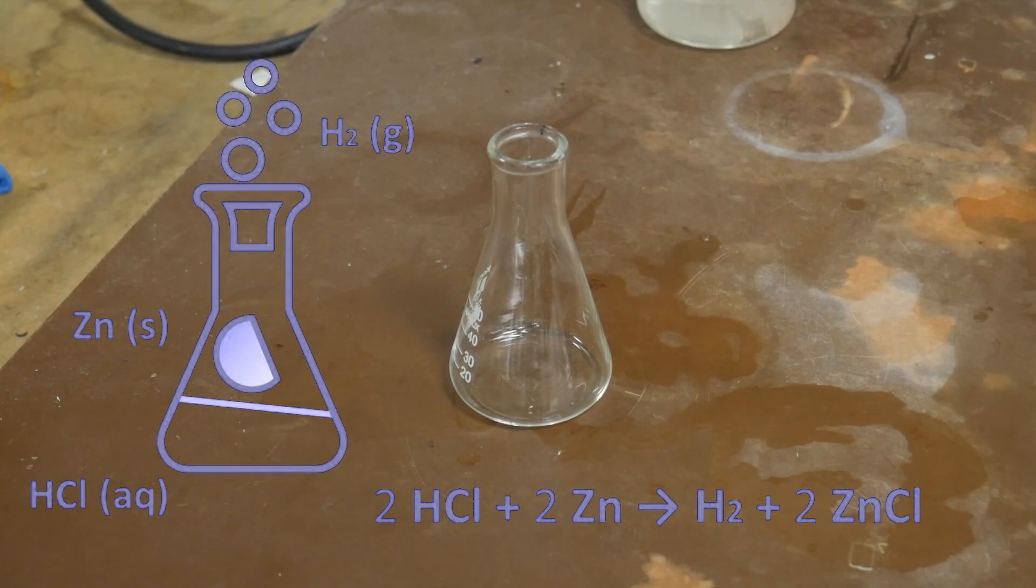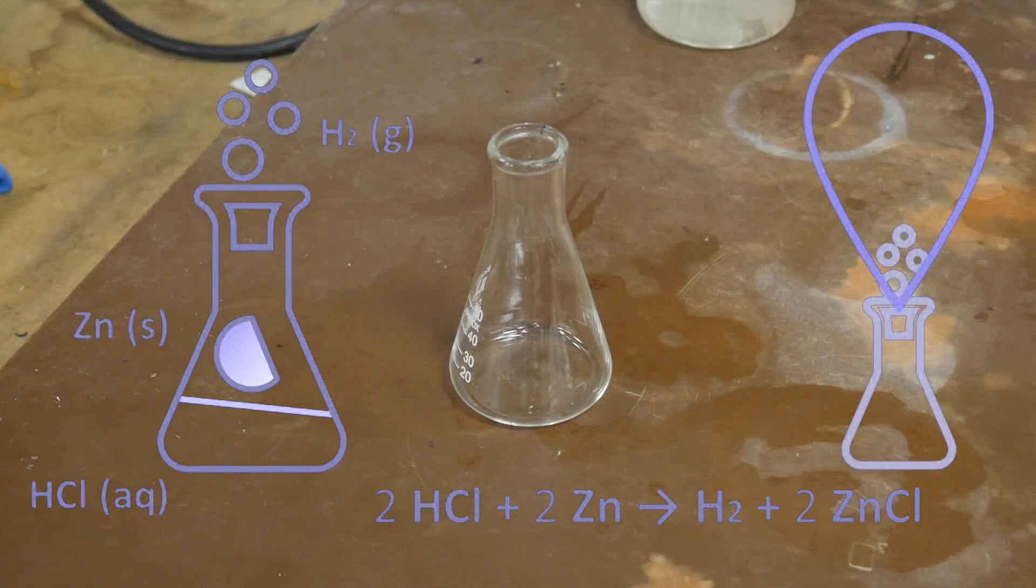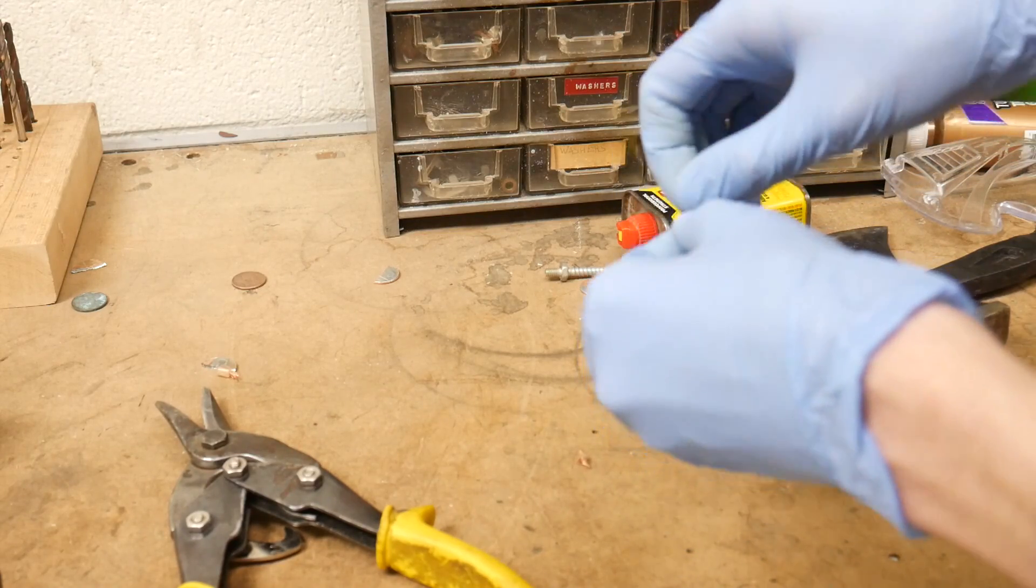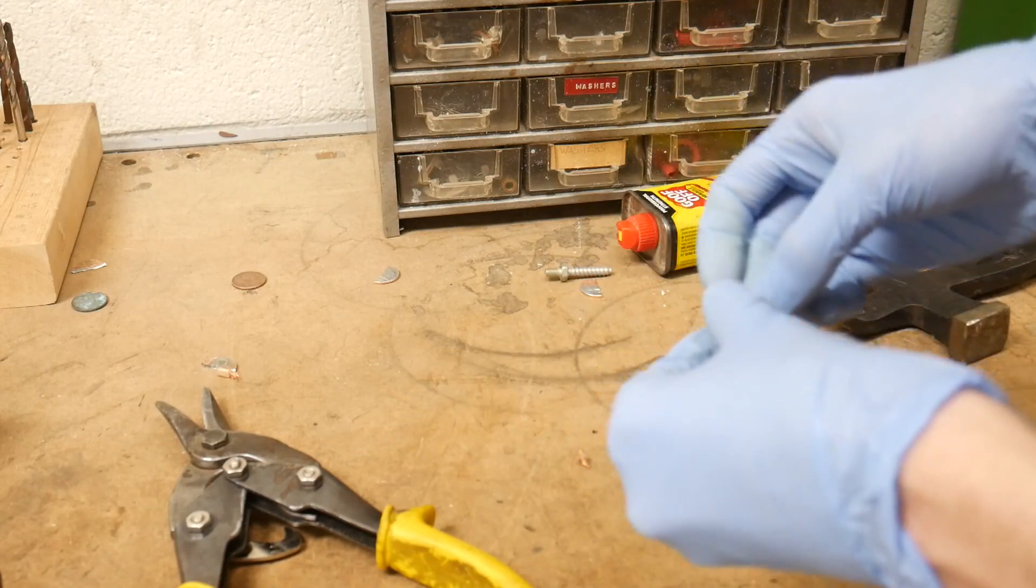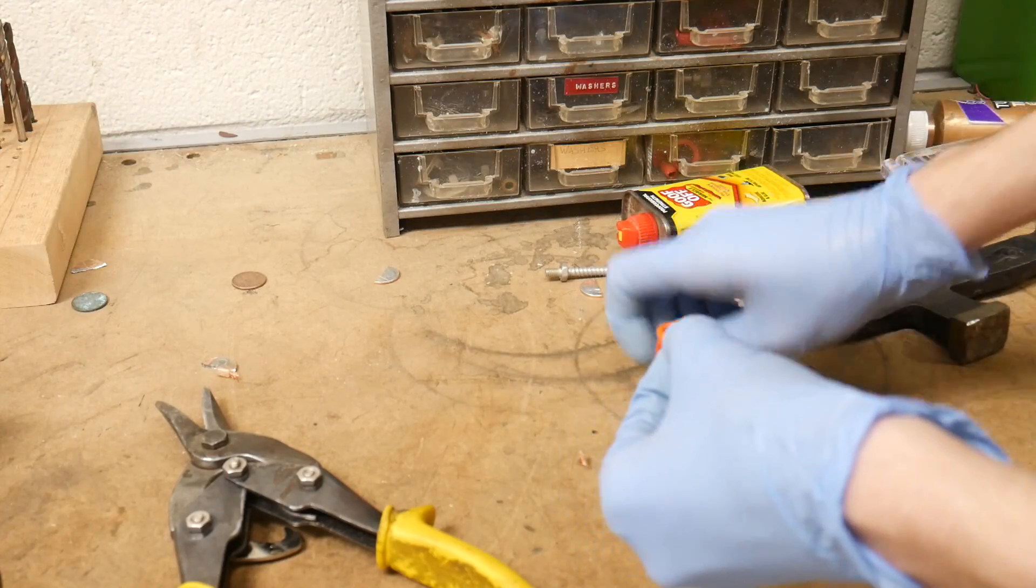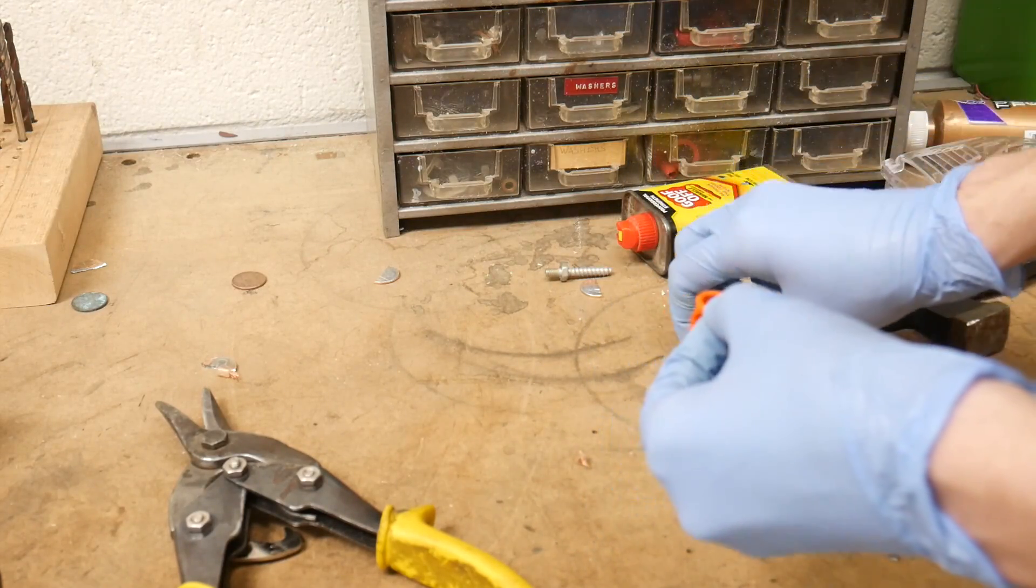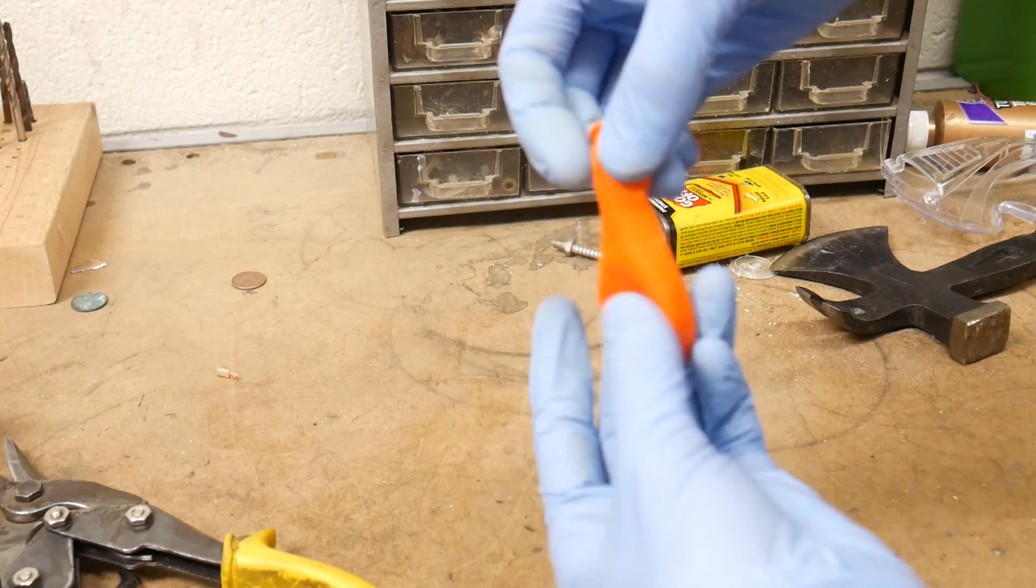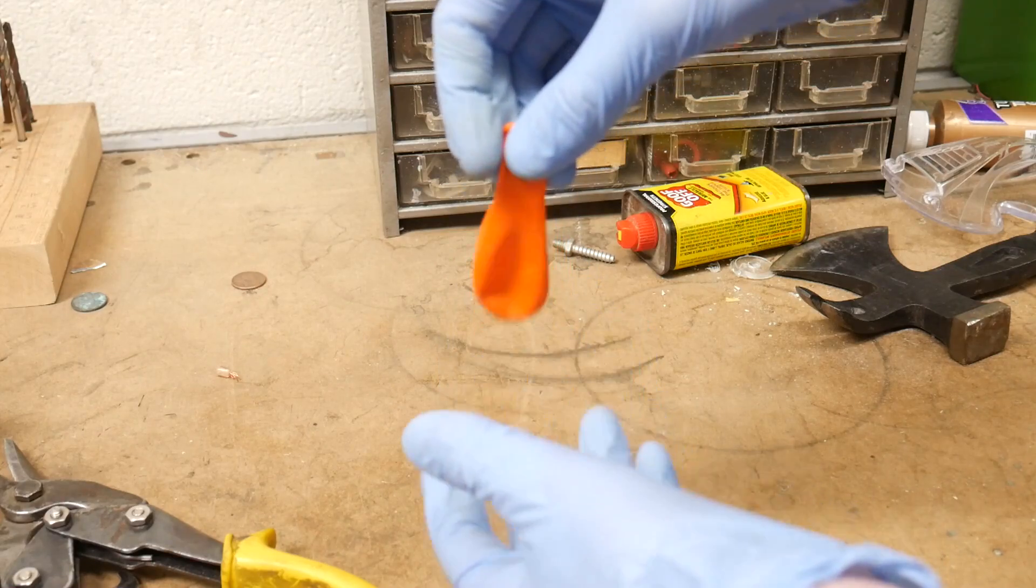Now this time when I make some hydrogen gas inside this Erlenmeyer flask I'm going to put a balloon on top and allow the pressure of the created hydrogen to blow it up. I'm just going to put our zinc pennies inside the balloon trying not to puncture it. So now we have our balloon filled with some more zinc. Let's go fill it up.